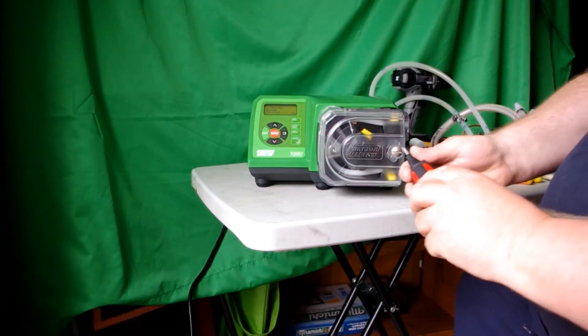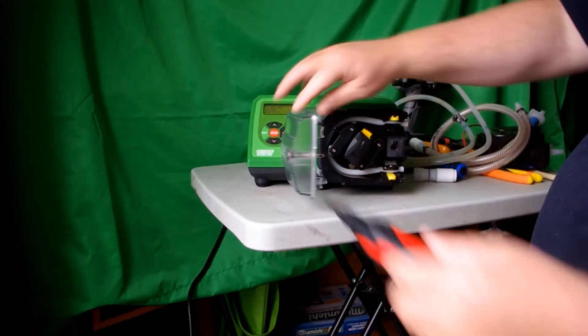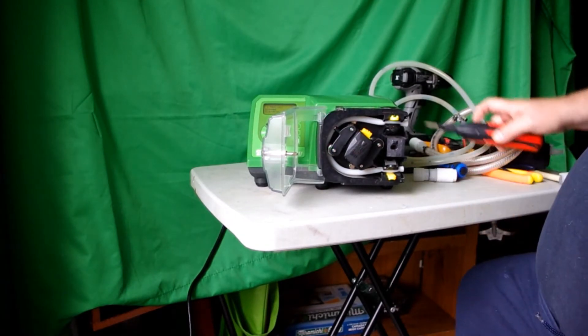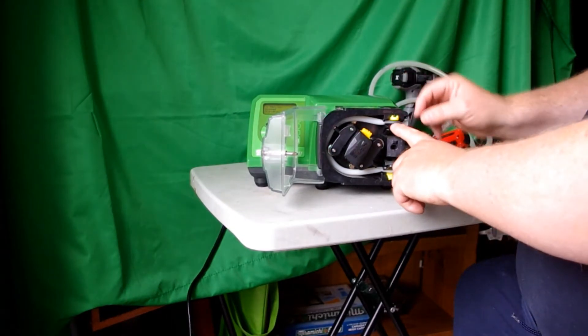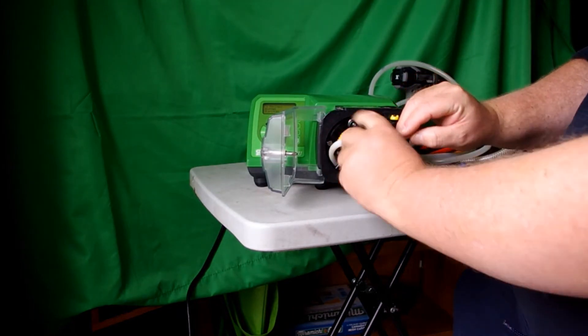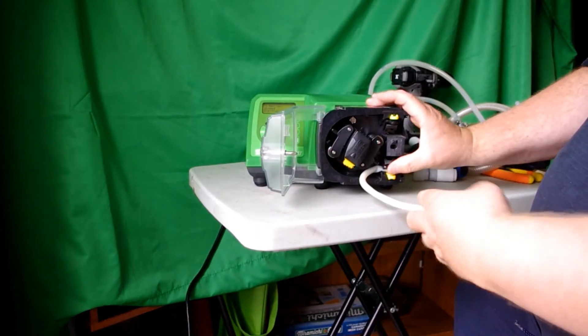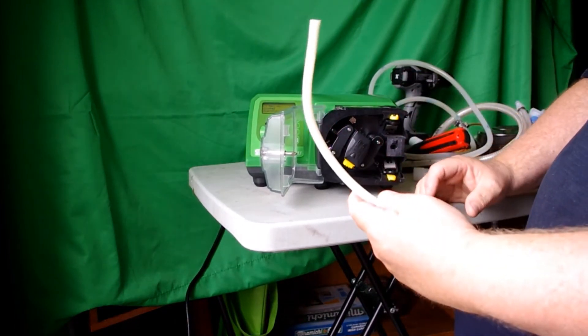Stop the pump, open up the door, release the pinch clip, rotate the pump while pulling on the tubing, release the other pinch clip and extract the tubing.